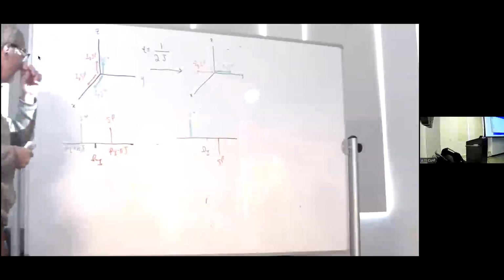So I put back up on the whiteboard the diagram that I made the other day that was virtually invisible to everybody online. The idea is that if we think about, for example, an amide hydrogen bonded to an amide nitrogen, an N15, then because the N15 is spin 1/2, the N15 spins are either in the alpha or beta state.